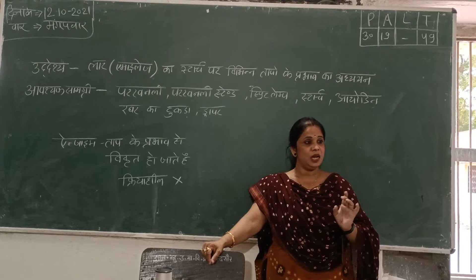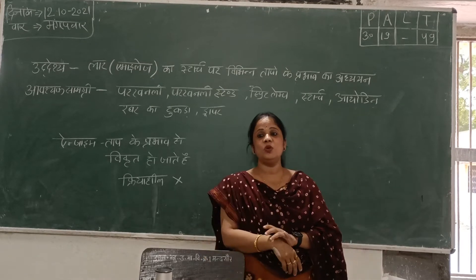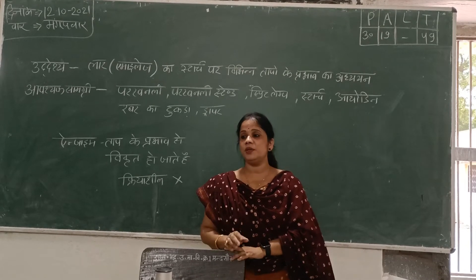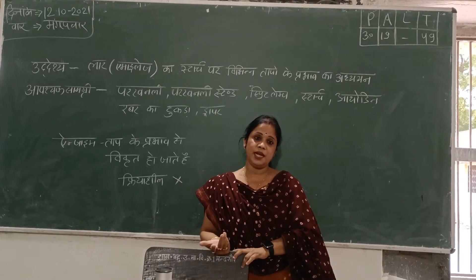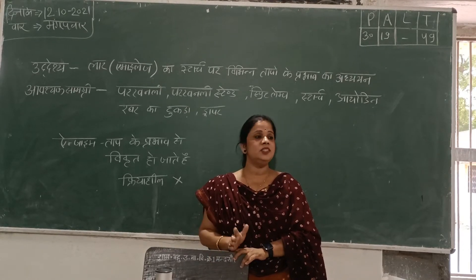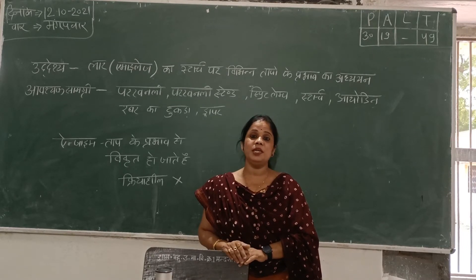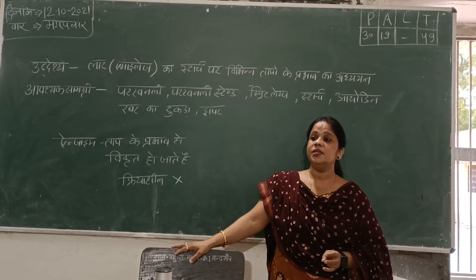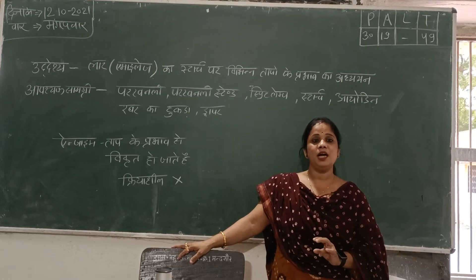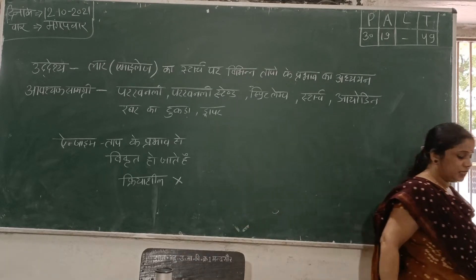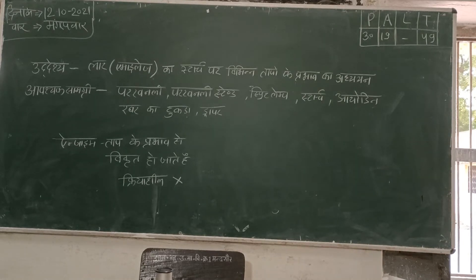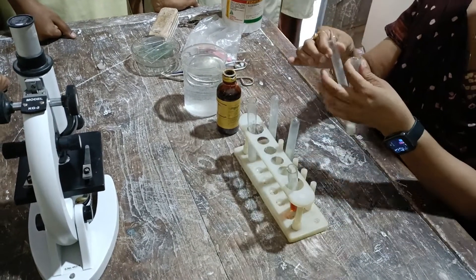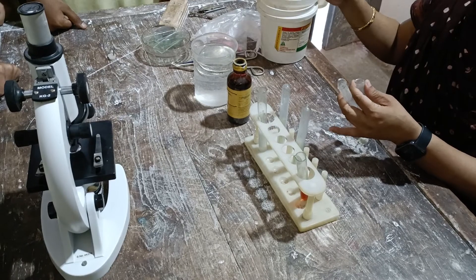This is our practical. Now let's warm the starch solution. We have iodine solution here — we have taken it in both test tubes. We have a starch solution prepared.